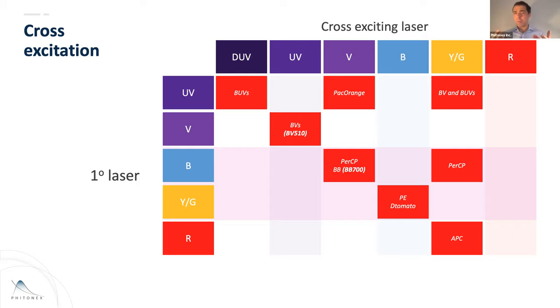And you think about this fundamental sort of, if you will, where we started in the field, and yet we're still underutilizing the detectors that are off there, right? I mean, you can even think about that, like, wow, why does a Fortessa ship with a trigon off of the blue? Well, there wasn't anything to detect on the blue, right? So it's even fundamentally affected the way we think about hardware. So we'll give you a different frame of mind on that, hopefully, today.